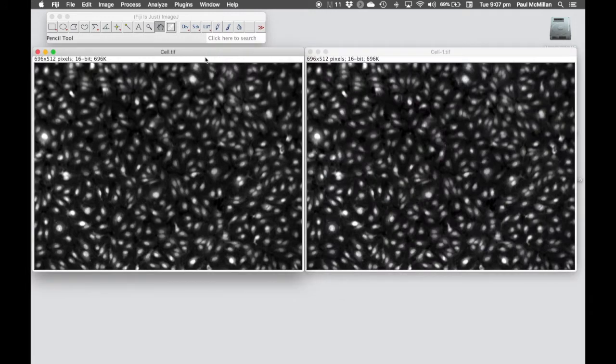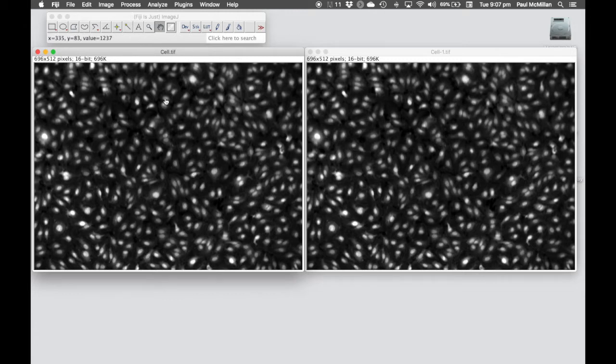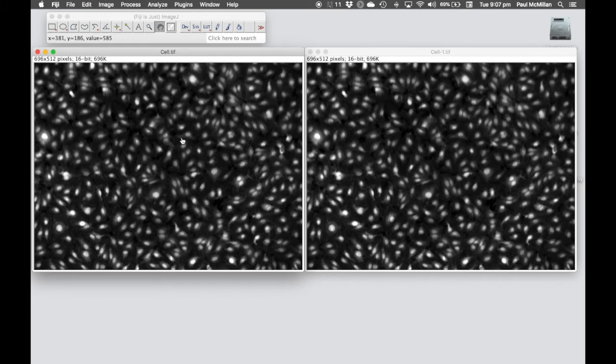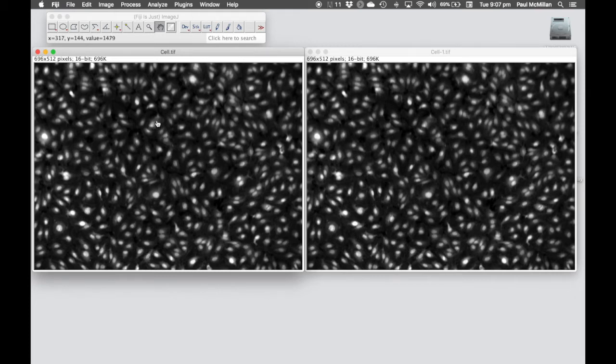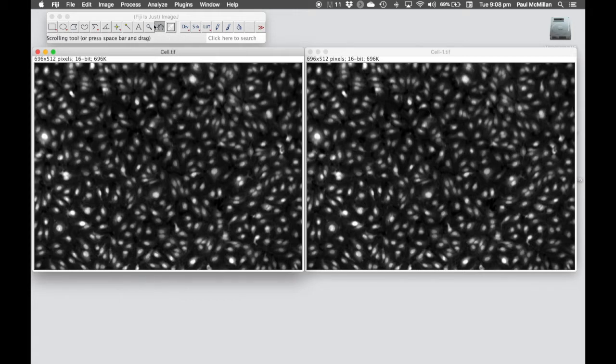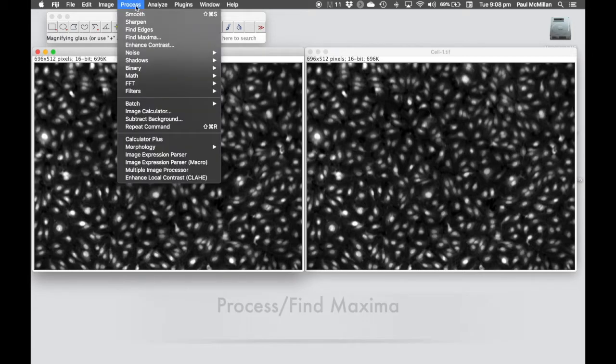In the first one, the first thing we're going to do is find the peak of each of these cells. The nice thing about this stain is it's very strong in the nuclei, so it allows us to identify, hopefully, one point per nucleus. To do that, we're going to process find maxima.